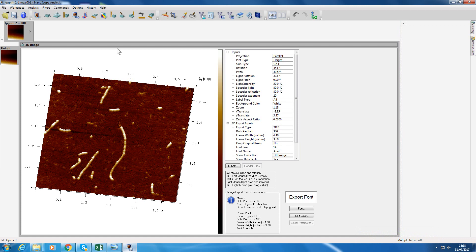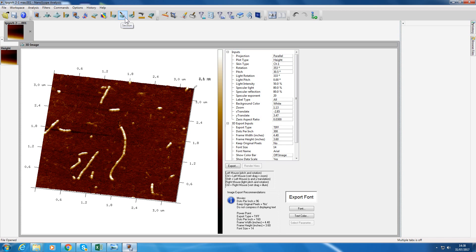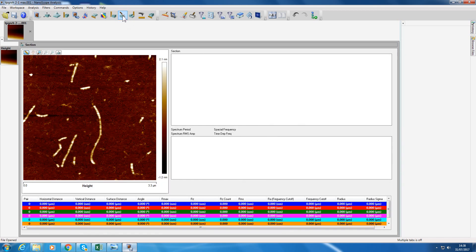The function you're going to use is Section. If you just hover above that, it's like a knife going through a three-dimensional shape. So click on Section and you can draw a line through your material.